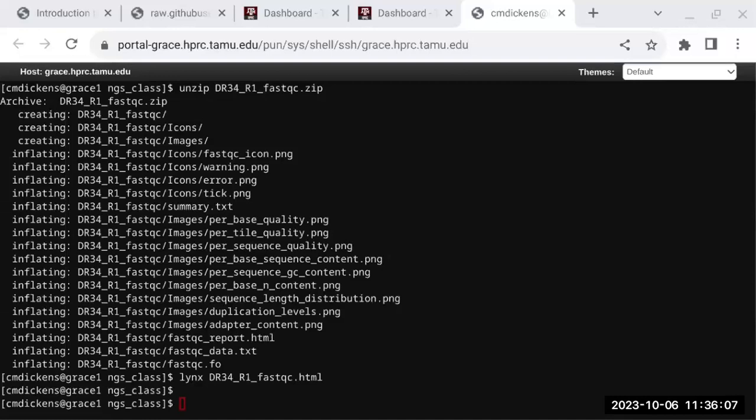All right, mapping reads. BWA is very popular. Bowtie 2, Bowtie, those are popular. We have a lot of genome indexes. Look in this directory, see if you find a genome index. If you don't, we can add it. That way you don't have to use up your file quota and disk quota to have these genomes in there.